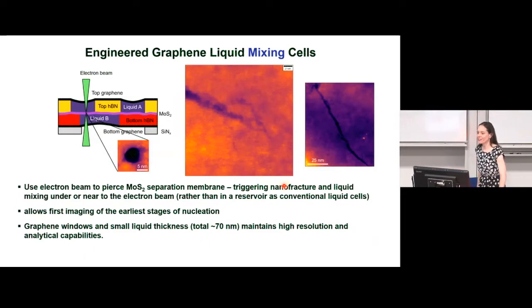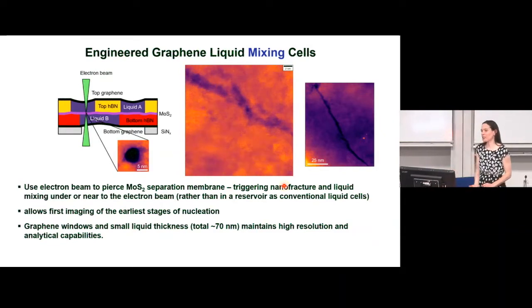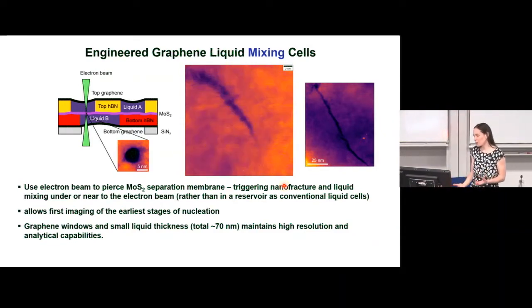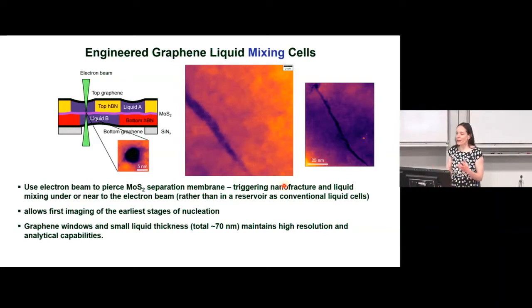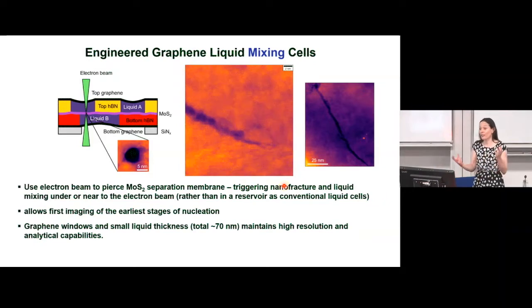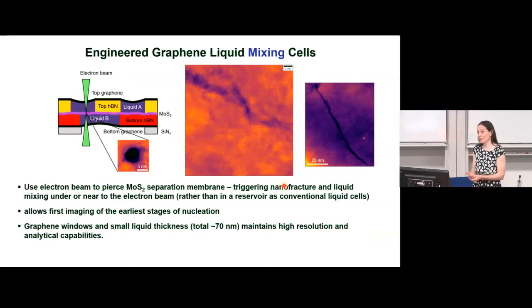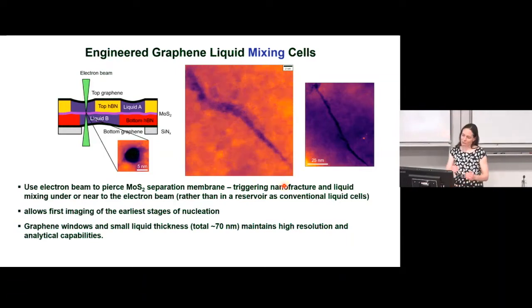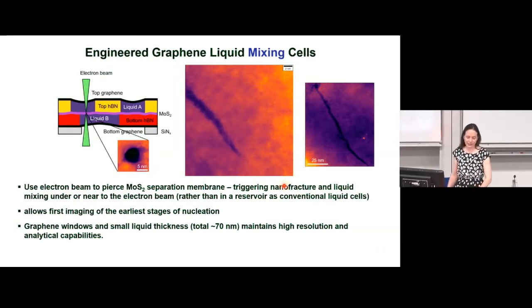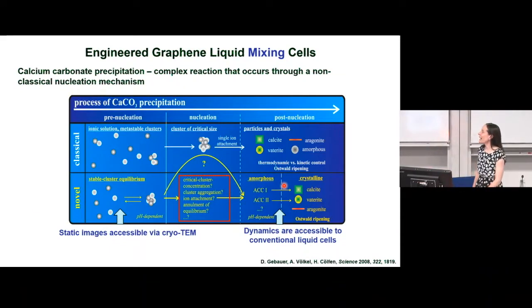Yes. So there, the interaction of the electron beam with the sample, which was the question, is a really important one, and probably temperature heating is much less important than the radiolysis effects, the interaction of the electron beam with the liquid, which has a whole lot of effects, including changing the pH. So yes, there's lots of things that need to be considered. I'm not going to go through the details of this. If anyone's interested, I'm glad to talk through it.